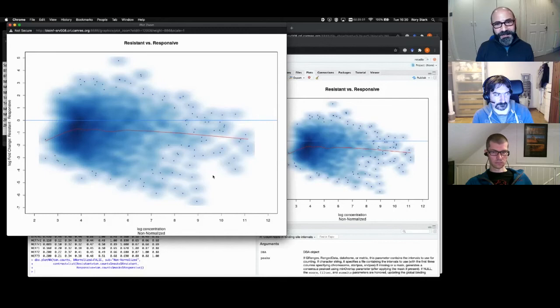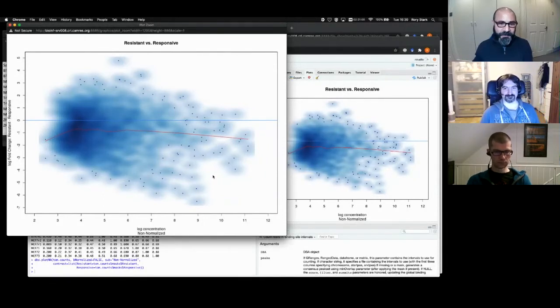So there's 2 ways of looking at this plot. You could say, I've got a bias towards responsive, maybe I should try and correct for that. And the other is to say, hey, I just made a biological discovery, which is the estrogen receptor loses binding in conditions of tamoxifen resistance. Maybe that's how tamoxifen adds to the resistance by stopping the estrogen receptor from binding. That is, the ER binding is what is interacting with tamoxifen, which making it work. So have I made a biological discovery, or have I screwed up my experiment?